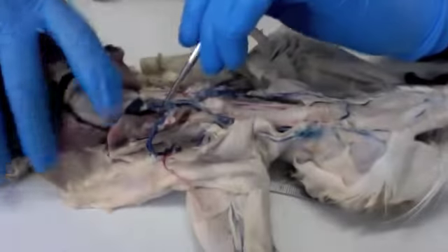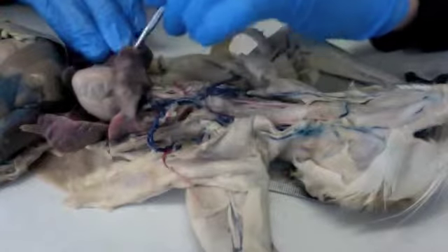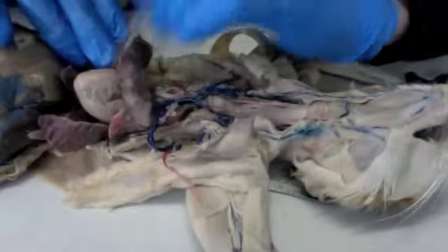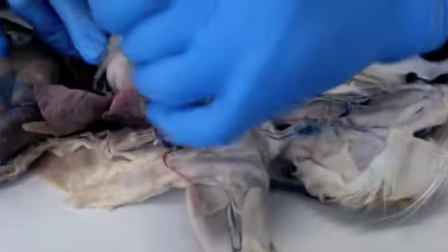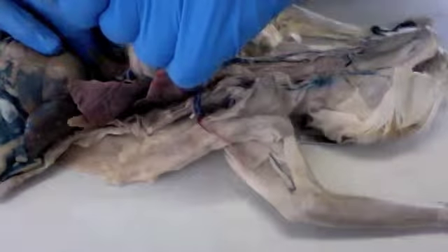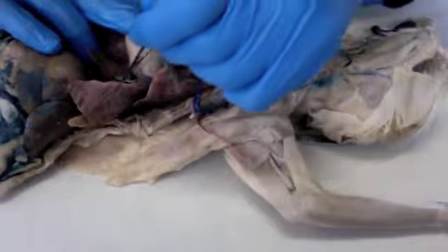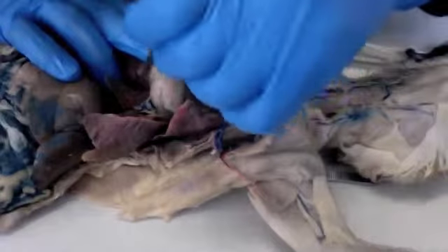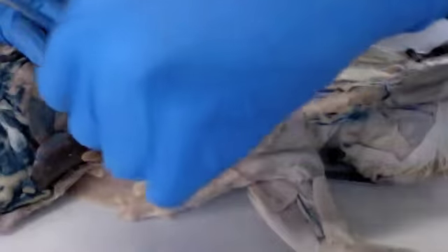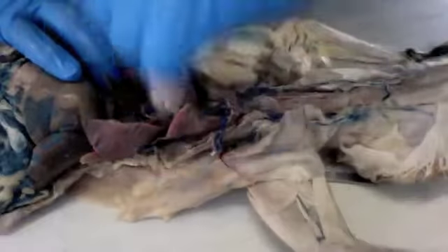And then we have the inferior vena cava, which is located down here. Lift up the heart. Let me see if I can get it. Good image here. Inferior vena cava, right here. Very blue. Very easy to see. Deoxygenated. Right here.